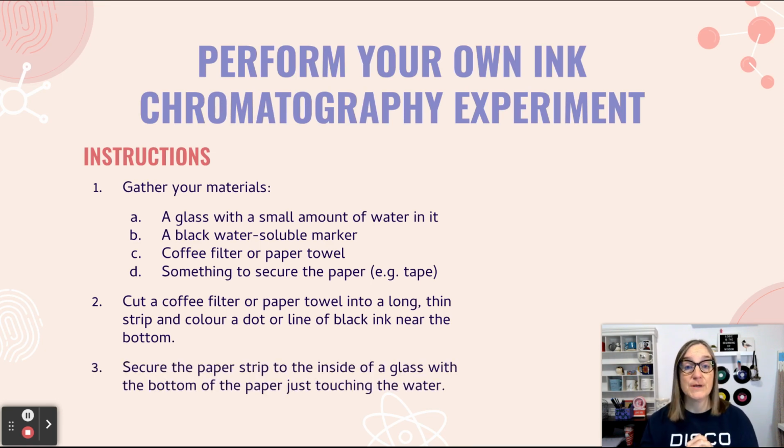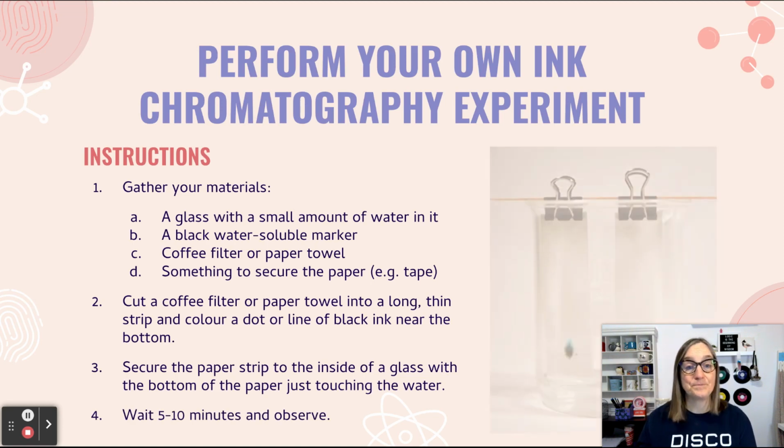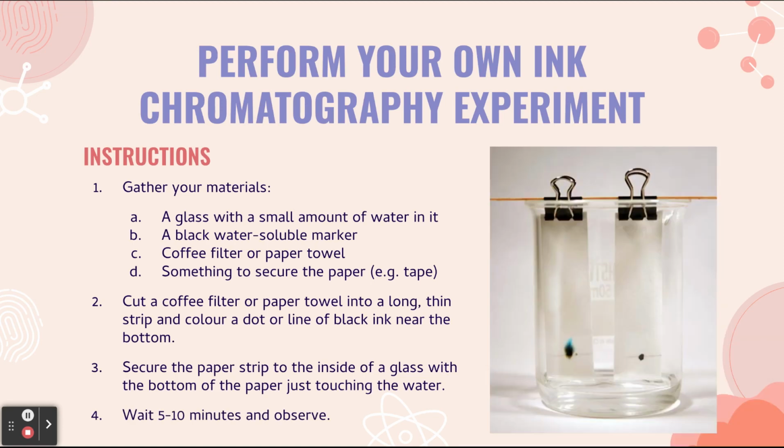Next, secure the paper strip to the inside of the glass with the bottom of the paper just touching the surface of the water. You don't want to dunk it in the water, just have it barely touch the surface of the water. Believe me, that's more than enough water. Then secure the paper and wait 5 to 10 minutes and then make your observations. And here's a picture of an ink chromatography experiment in action.